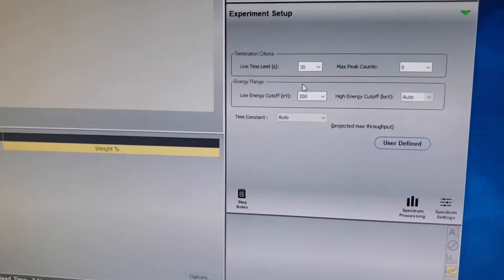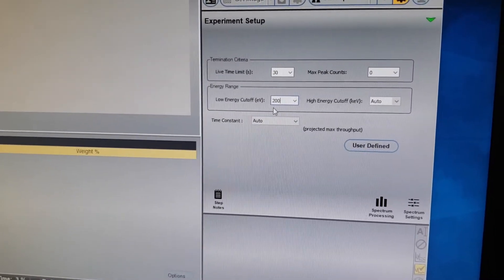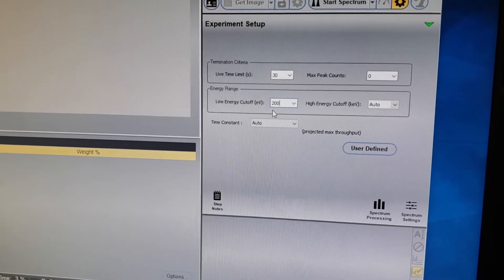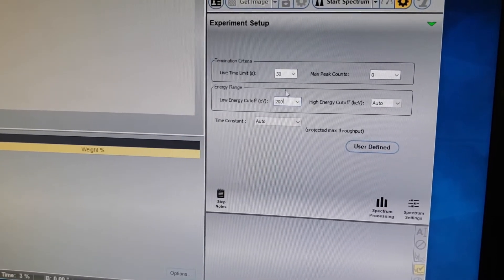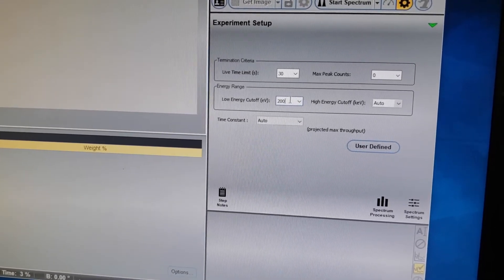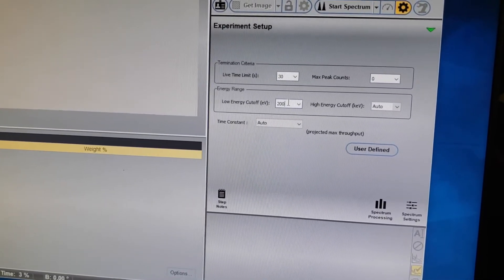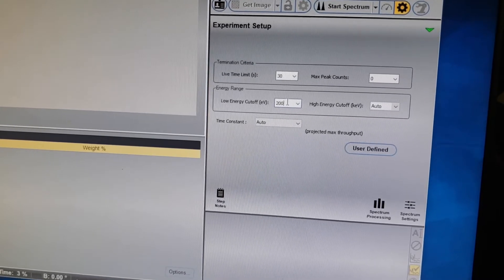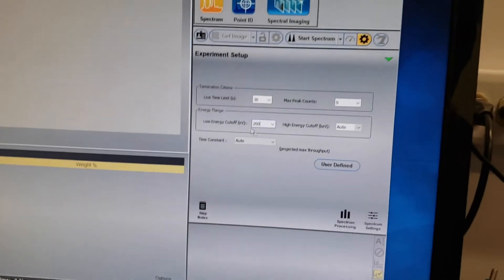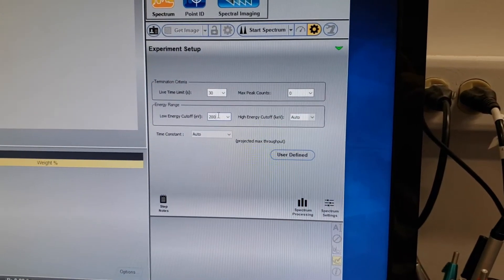However, you don't want to go below 150 eV, otherwise you start including beryllium. Our EDS detector has a beryllium window on it, so if you allow it to include beryllium as an element, it will tell you that everything is made of beryllium because it's looking through a beryllium window — kind of like if you're looking through a red piece of glass, everything appears red. So we tell it to start at 200 eV, which ignores beryllium and boron and starts at carbon.